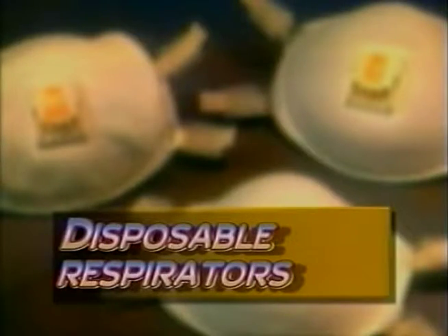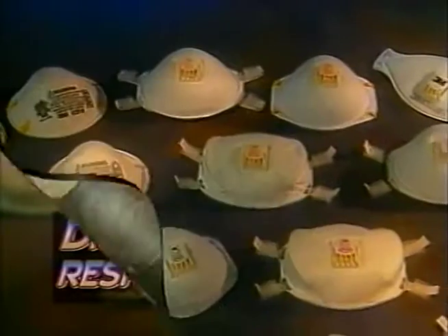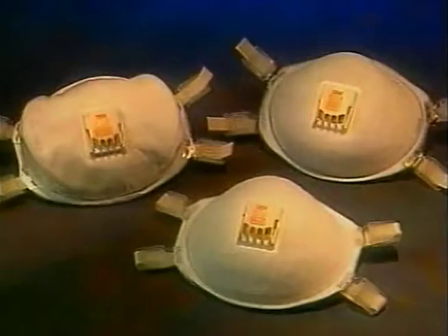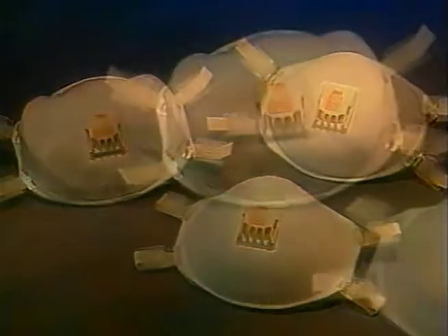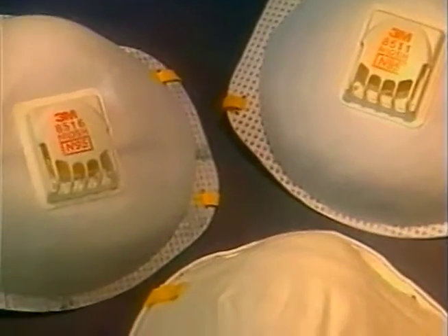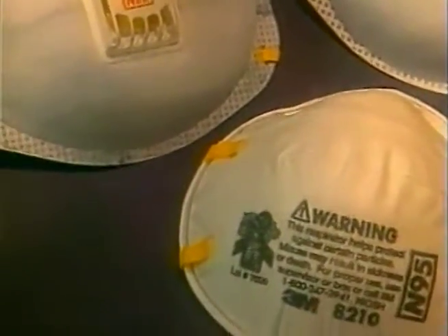Disposable respirators are commonly used for protection against particulates such as dust, fumes, and mist. There are many makes and models of disposable respirators. Some models have an exhalation valve. All will have double straps, either adjustable or not. The NIOSH-approved N95 is the most commonly used particulate respirator in the workplace.